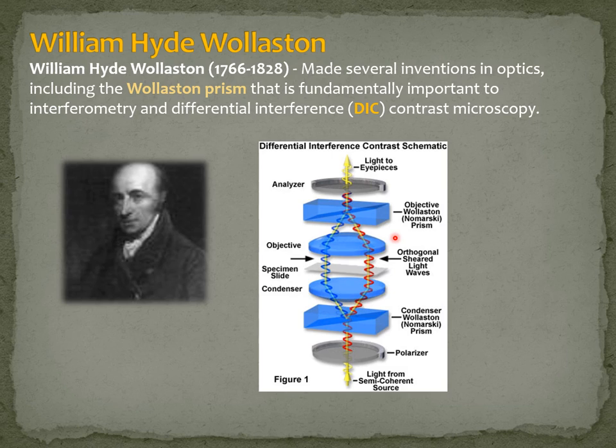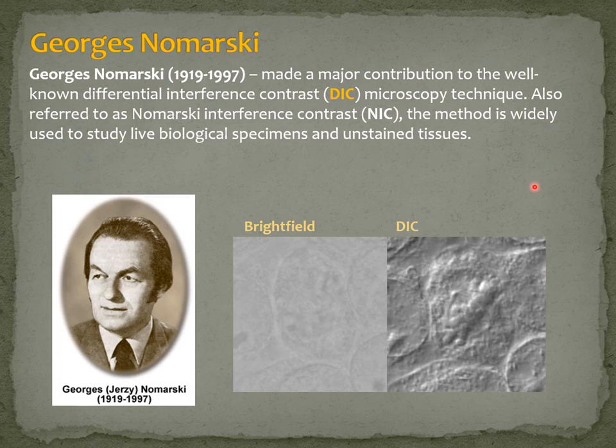How can we visualize this? In order to help you visualize, I will also take advantage of the contribution made by George Nomarski, who developed further the Wollaston prism, and the contribution of these two individuals nowadays is what we call differential interference contrast.